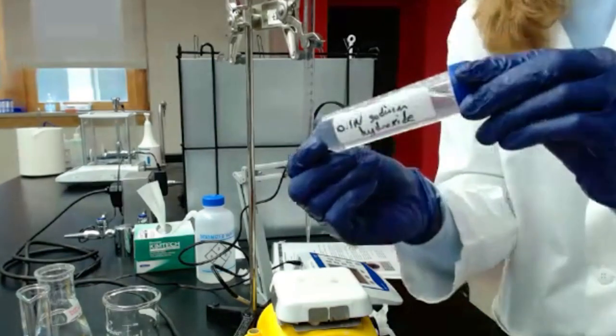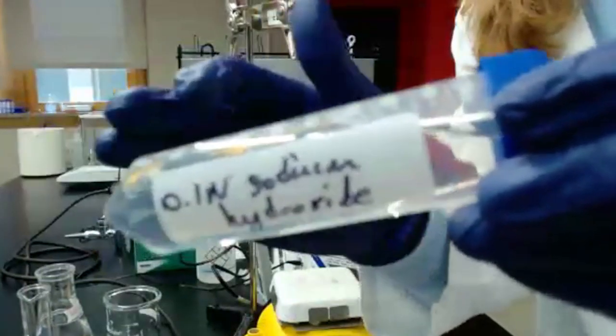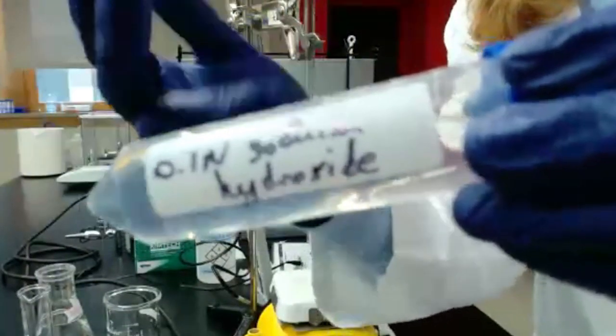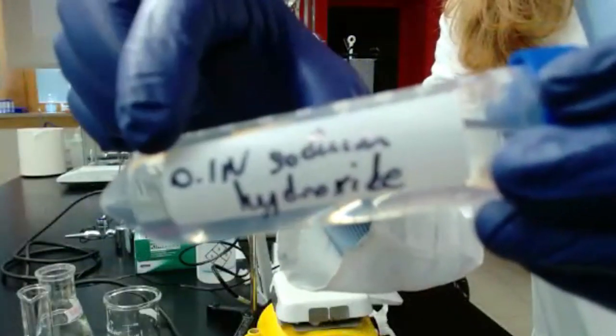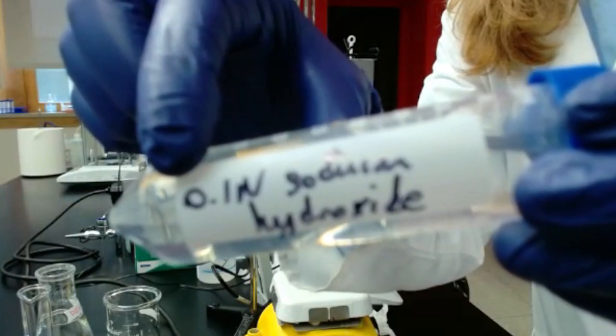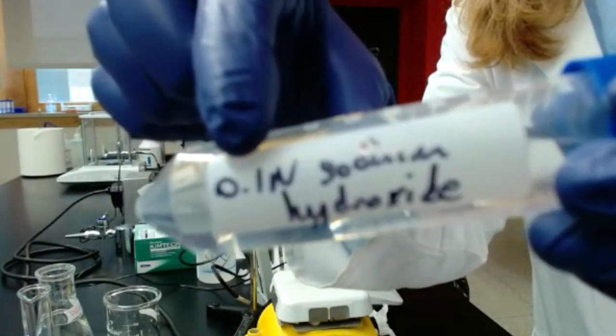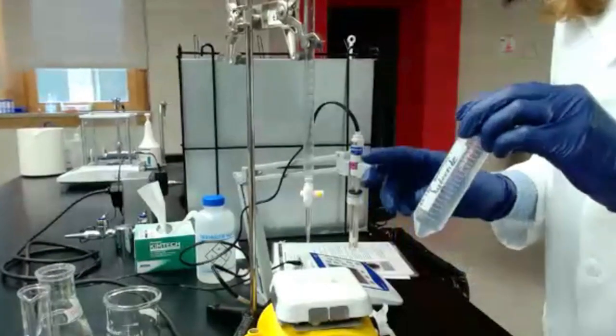So the sodium hydroxide I'm going to use is coming from a standardized solution, but that's just for ease of use. We are going to use a 0.1 normal. Normal, so N, is the strength of sodium hydroxide. So that's the solution we're going to use today.